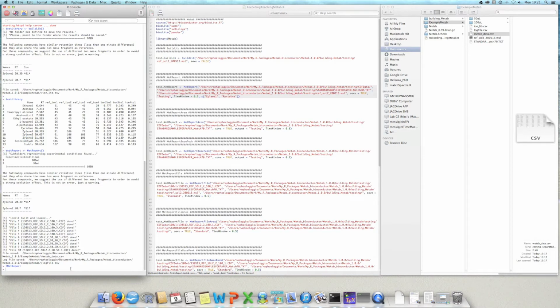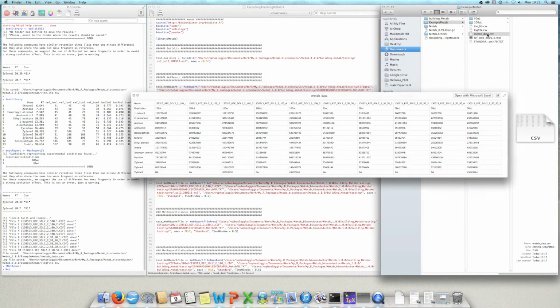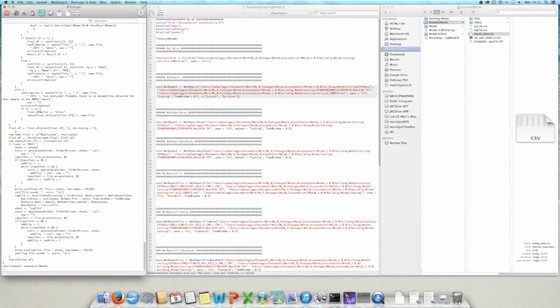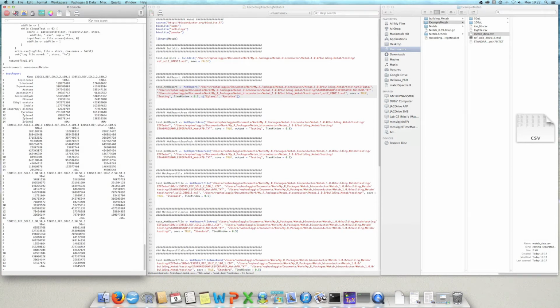So let's see the result. As you saw before, the results are in this data set. However, the result is also here in R. If I put MetReport, test report, that's the variable that we used. The same report that you have in the file, we have here in R, the same information. Let's suppose I don't want xylene 3 to be in the report.